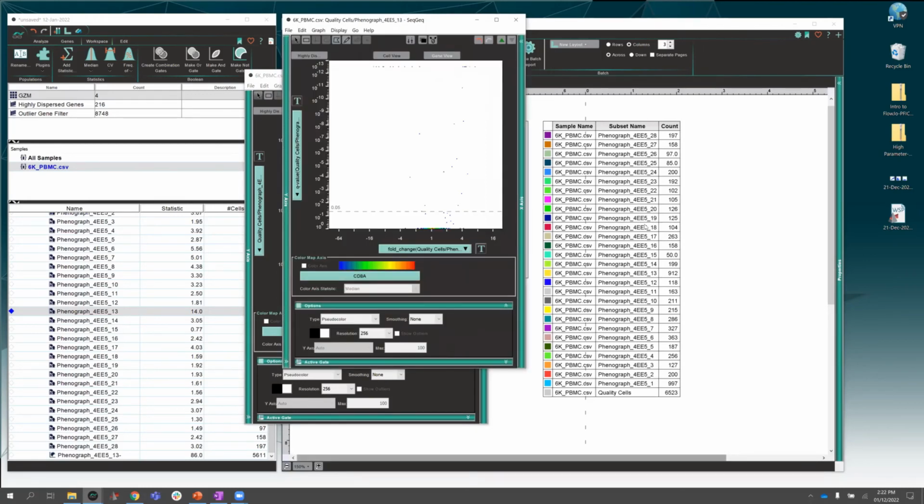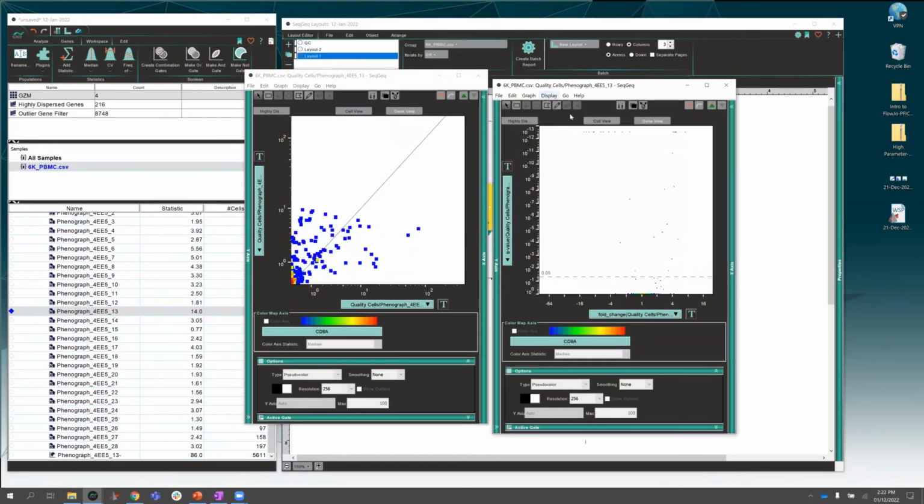And so now, a little hard to see. Let's make those dots a little bigger. Okay, so now I can see fold change, whether those genes are upregulated in cluster 13. Cluster 13 is on my x-axis, so it's going to be the one chosen for the volcano plot. So up in cluster 13 or down in cluster 13. This is a negative fold change, meaning it's going down. And we have kind of an inverted p-value axis here. So p-value of 0.05, it gets lower as you go higher. This is an inverted axis.